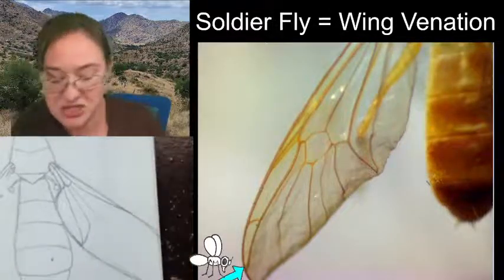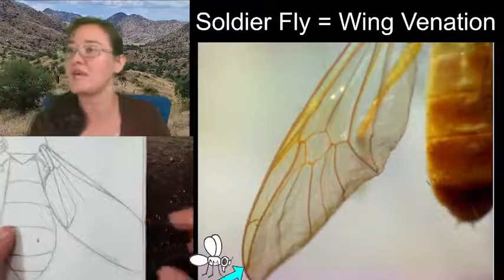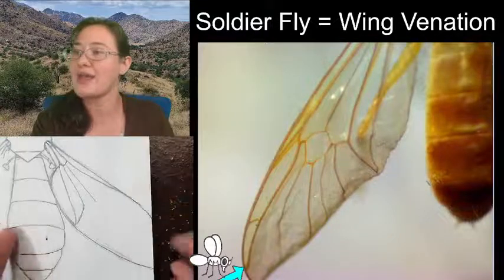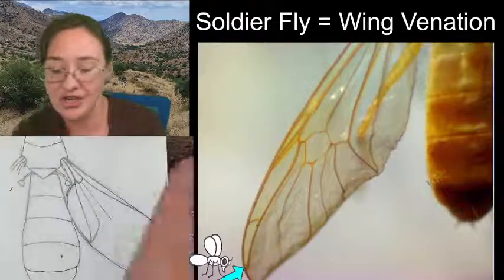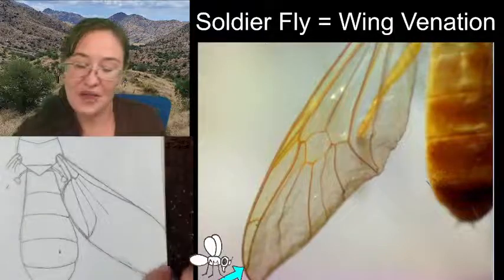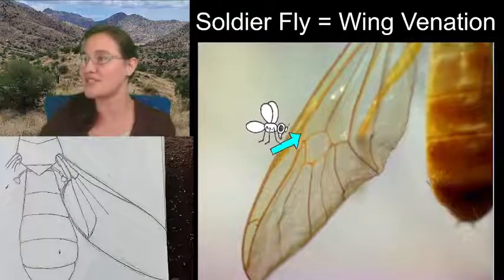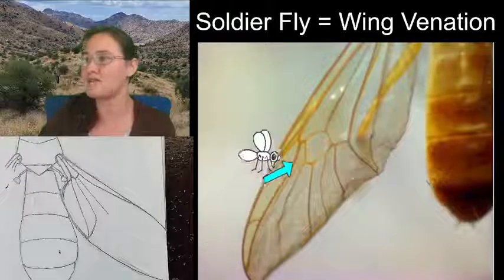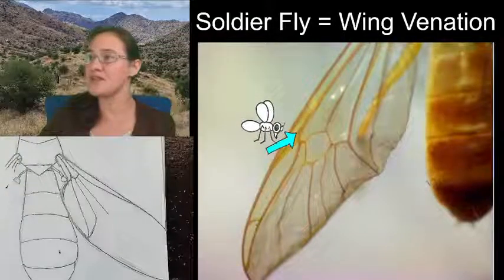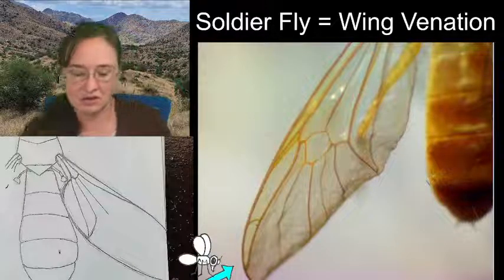So I'm going to change just a little bit of the angle of the very edge of my paper because I want to annotate that the wing is coming to a close eventually. All right. Let's see, from right about here is where I'm going to start. I want to grab this vein and pull it over and meet this. So this connects the subcostal vein and then comes down and meets the costa.